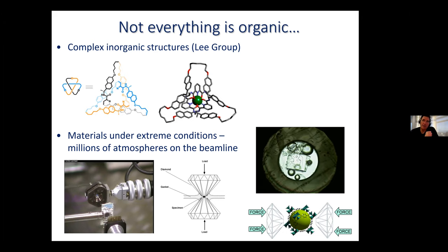And probably the key method is to follow the structure of such materials as you expose them to millions and millions of atmospheres. And you can do that in the laboratory with this wonderful device here. So there's the photograph here on the left. This is about 20 millimeters across. You can hold it in your hand.